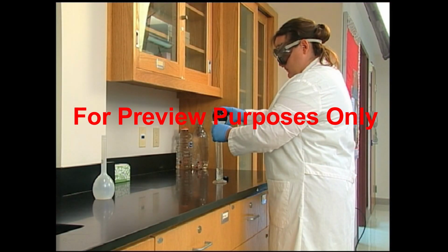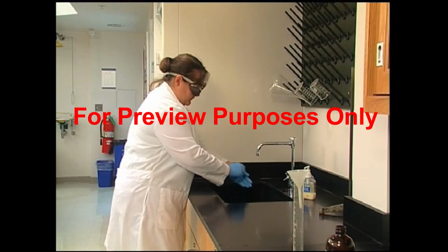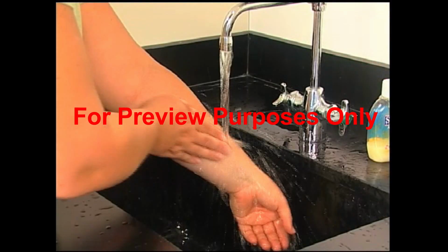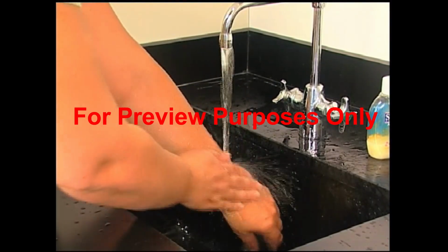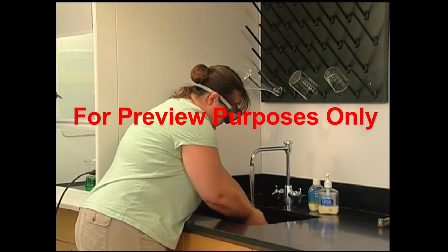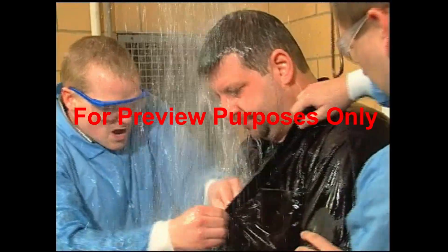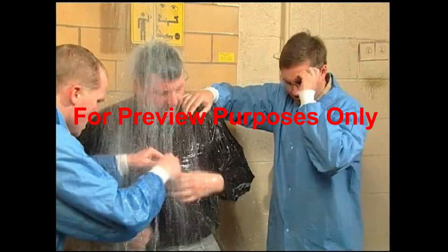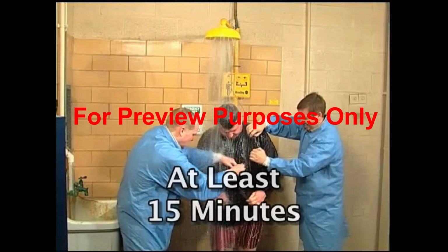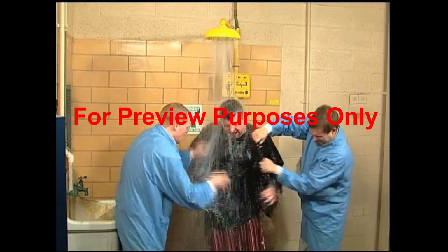If you come into contact with formaldehyde, it's important to act quickly. For skin contact, immediately remove any contaminated clothing. Wash the affected area with soap or mild detergent and large quantities of water for at least 15 to 20 minutes. If the area of contact is large, get to a safety shower. Remove all your clothing and stay under the water for at least 15 minutes. Be sure to get medical attention after any contact.